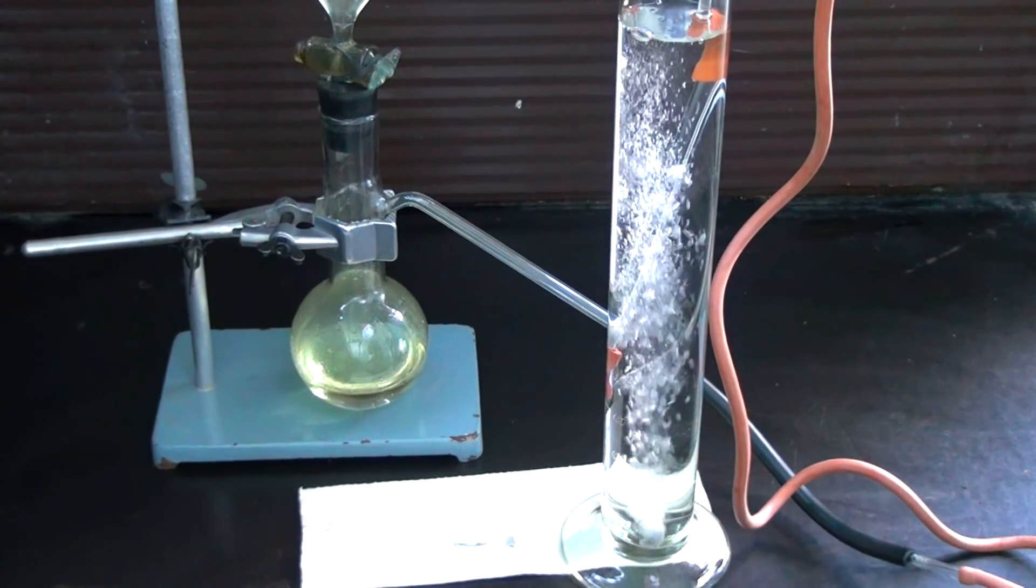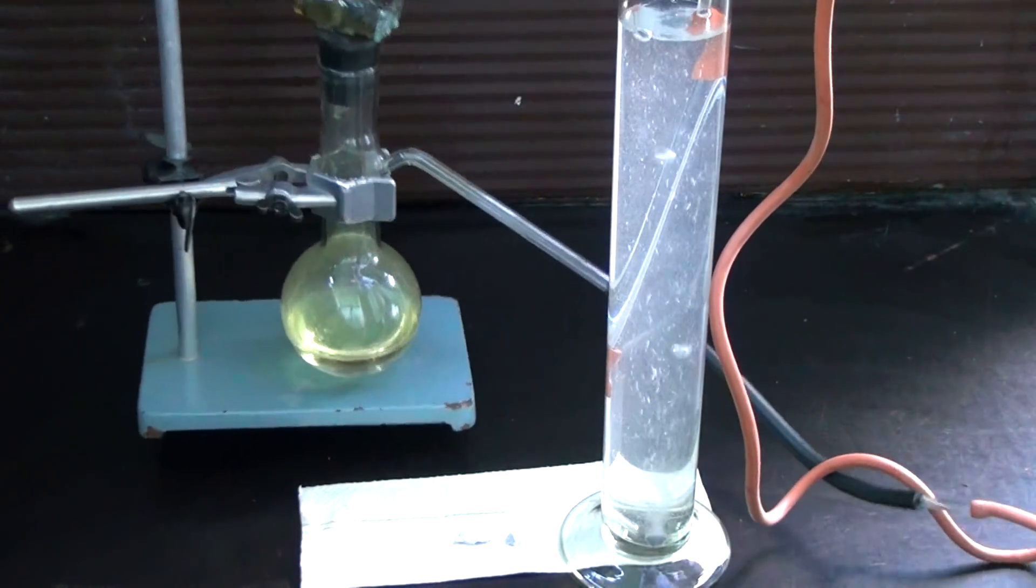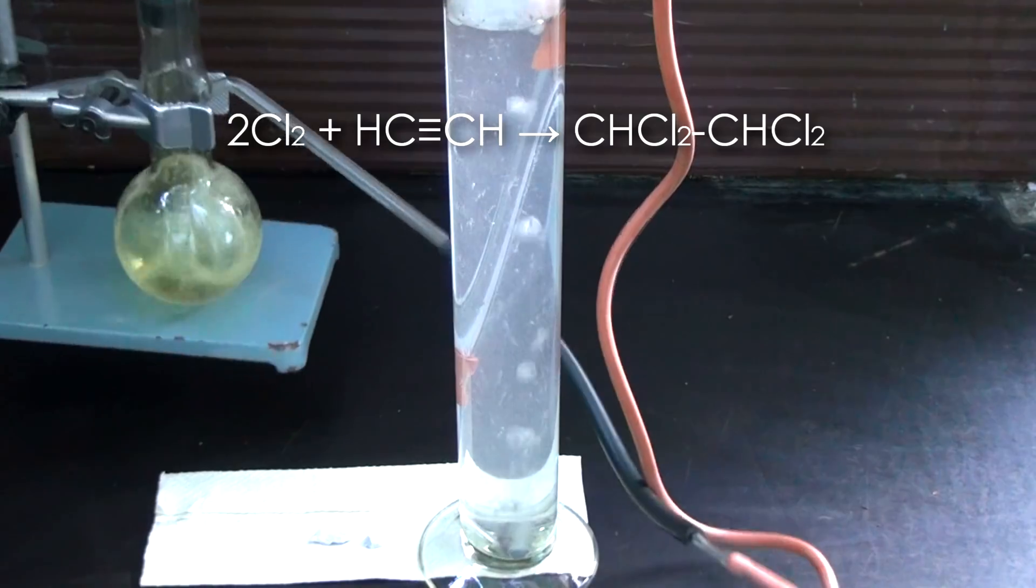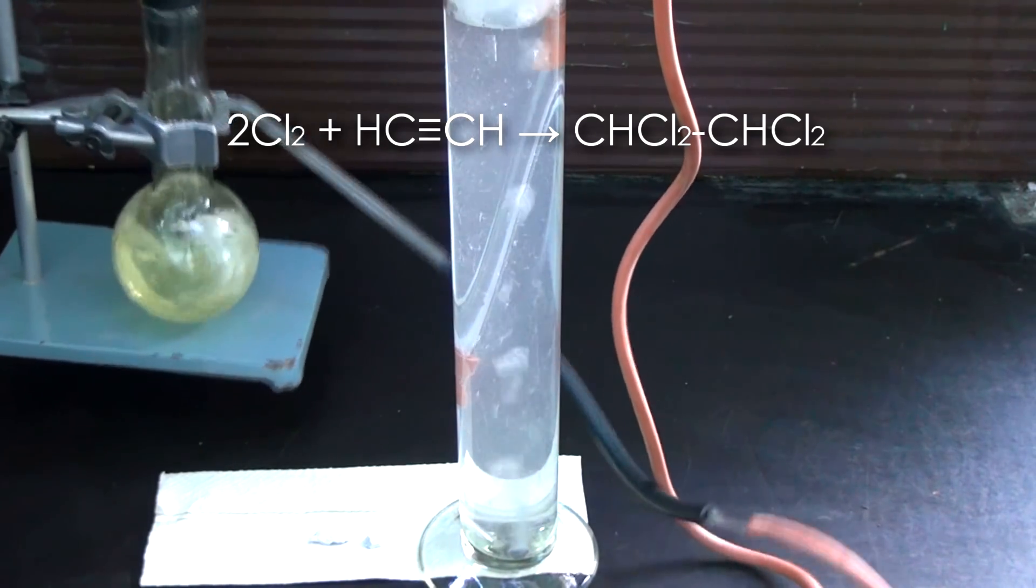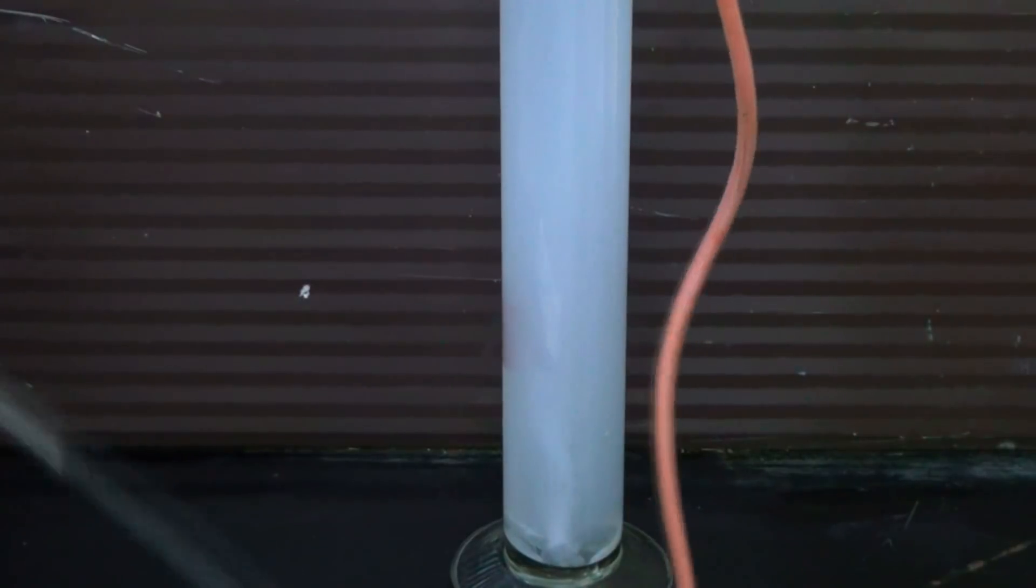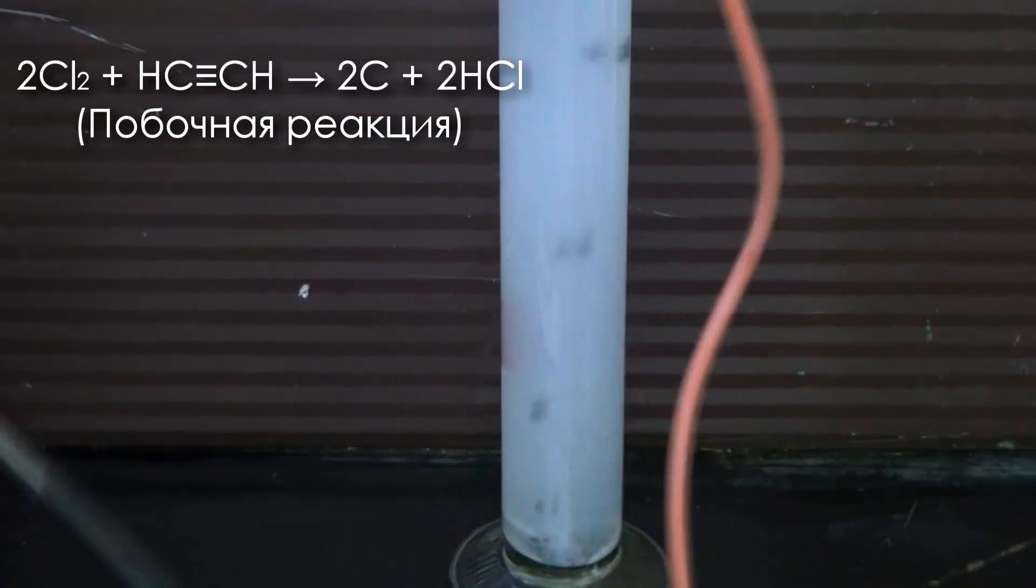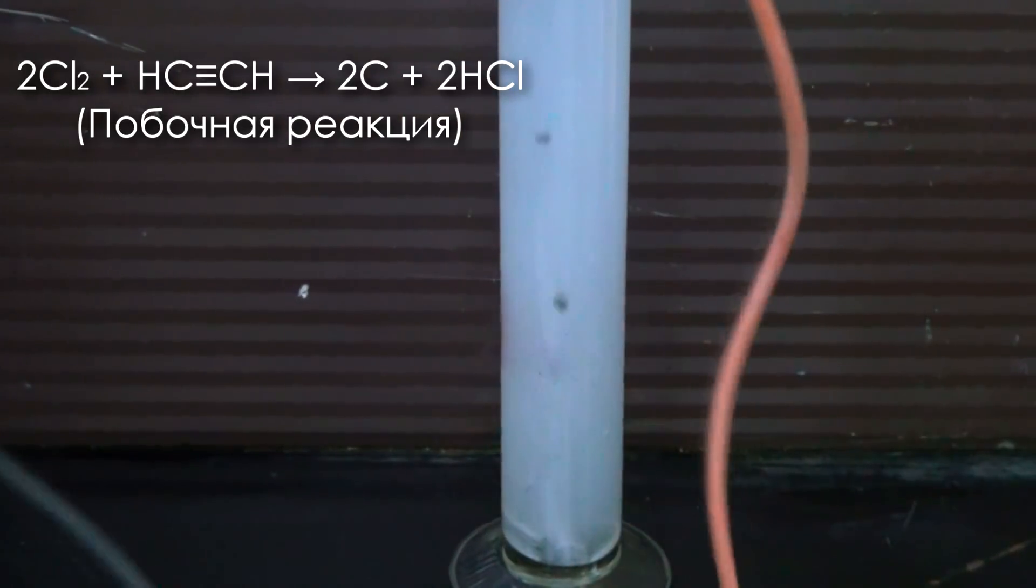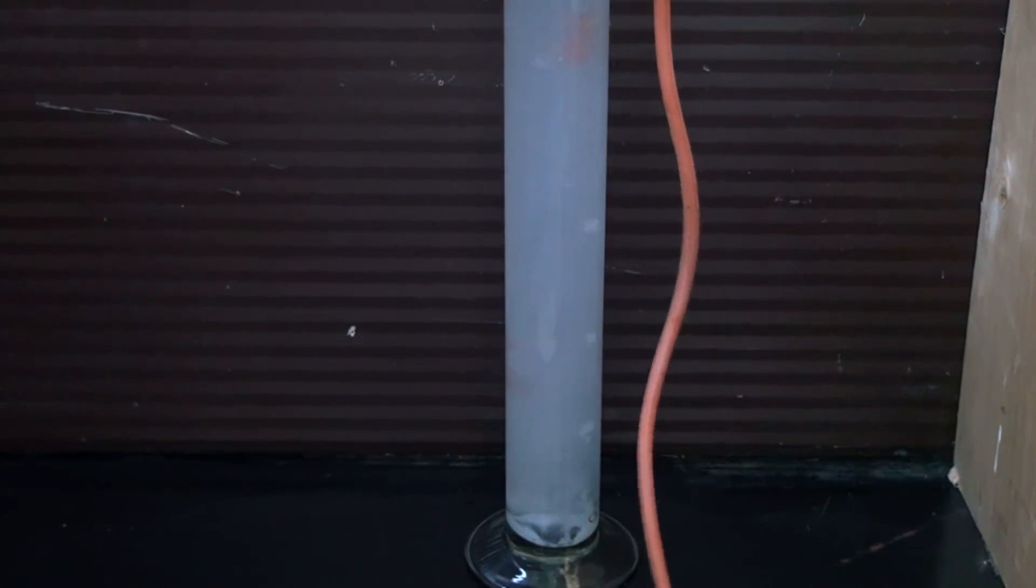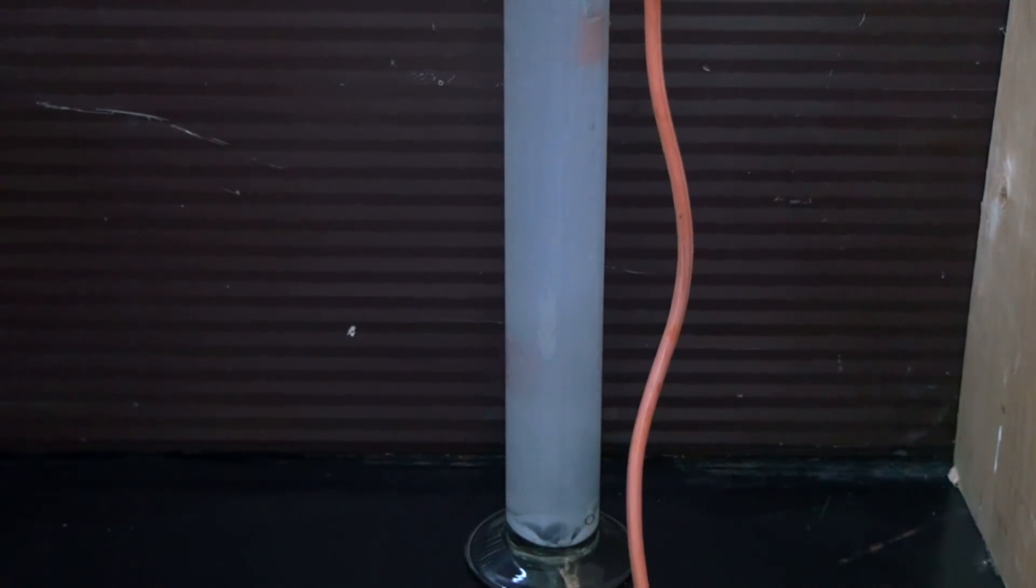Also, if you throw calcium carbide into a cylinder filled with water and then start letting chlorine into this vessel, you can observe an interesting effect, the burning of acetylene with chlorine underwater. Chlorine can react at room temperature with acetylene, forming carbon and hydrogen chloride, as well as a series of intermediate halogen derivatives of acetylene.